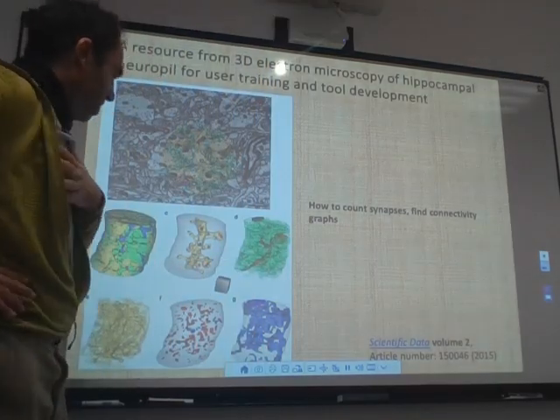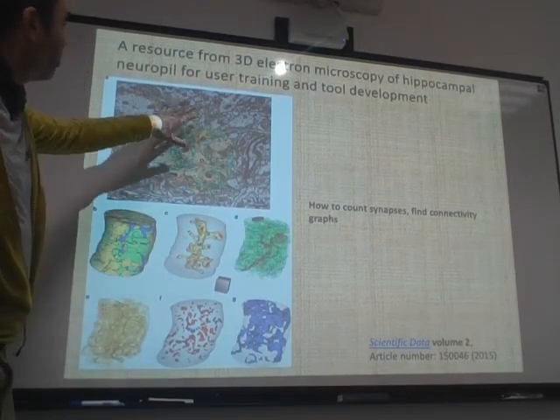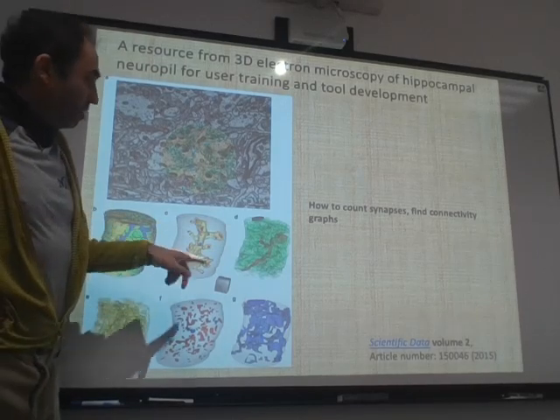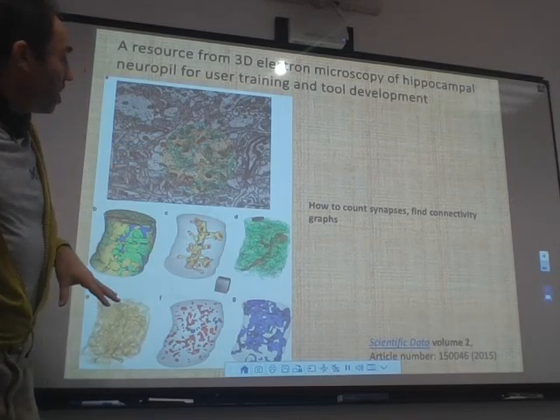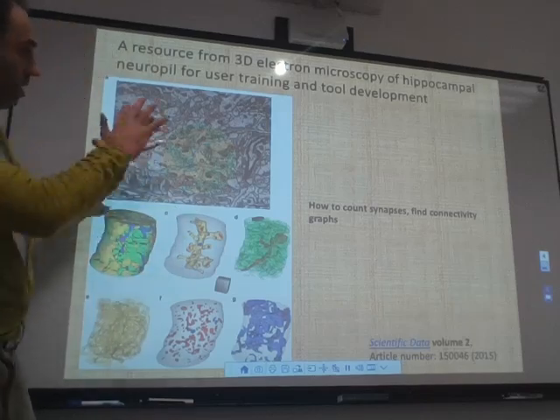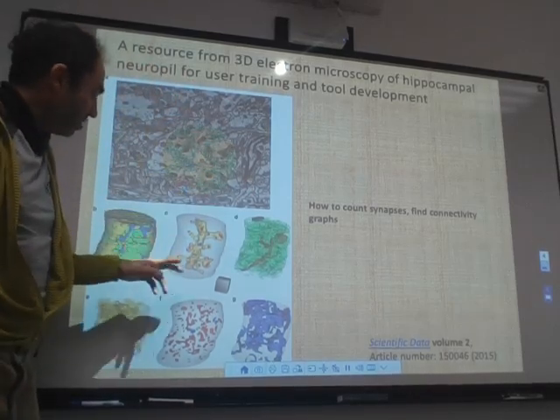Yeah, so finally, this is some years ago. So this is, again, electron microscopy data. So people are able, for example, to extract from this type of images the 3D, this is a 3D stack. You can take some slices.